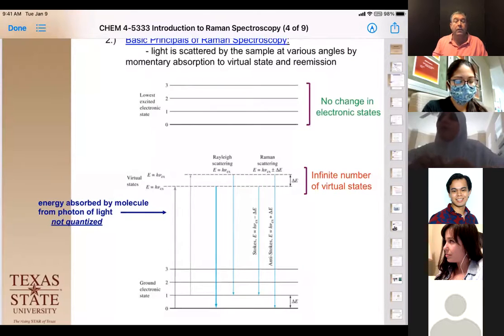That's not the energy that would make the molecule vibrate, and that's not the energy that would make an absorption in the UV. This is a lower energy, so we're not looking at those states. We're looking at when it does do an excitation, what is the change in frequencies given off at 90 degrees from the incident light. So that's why it's different.